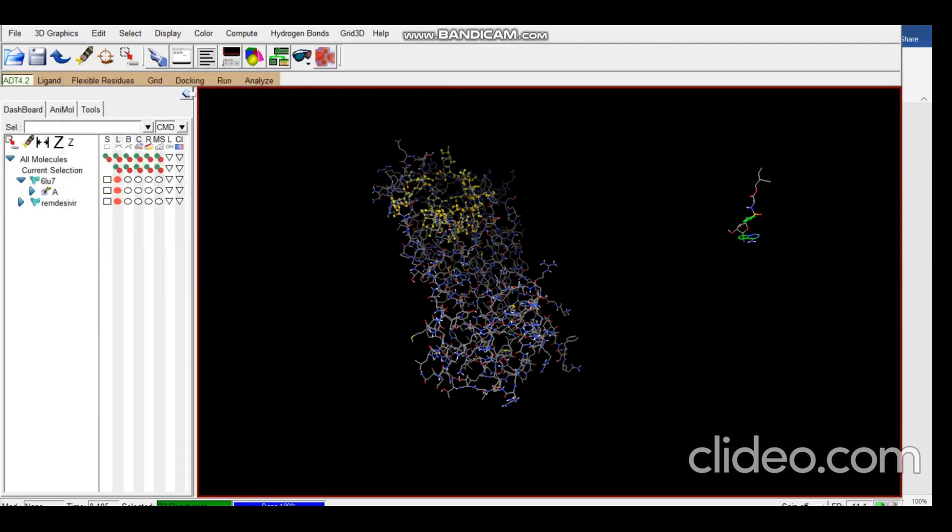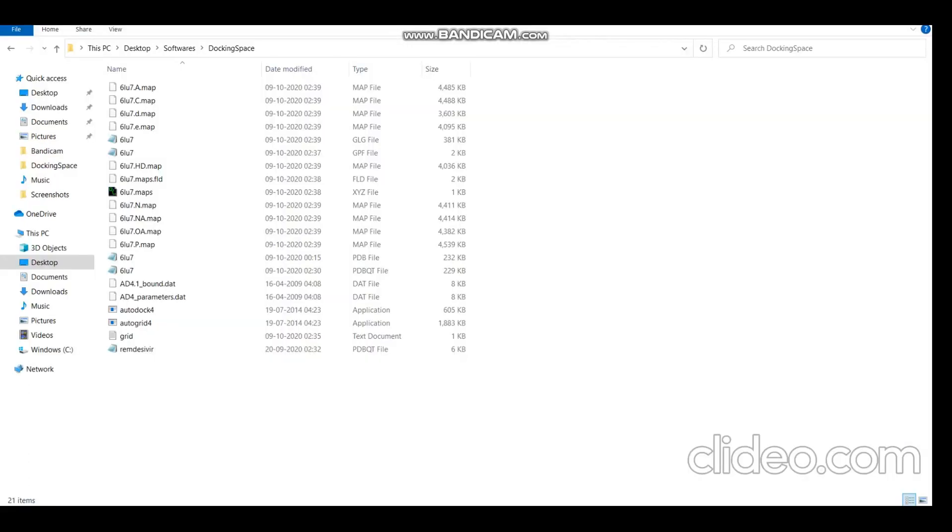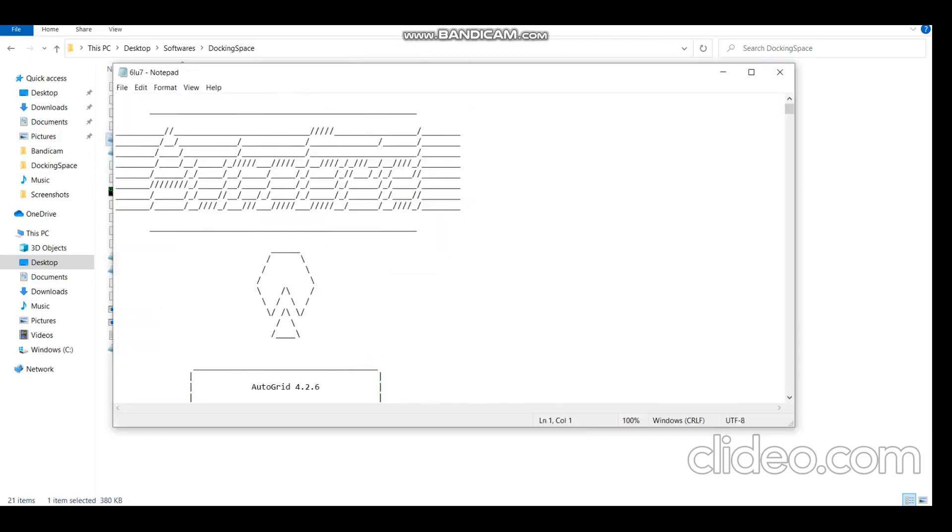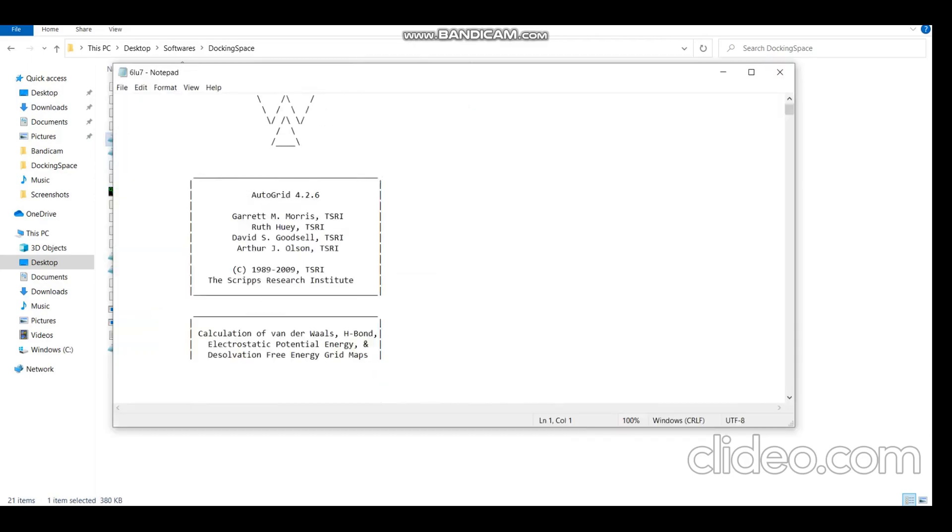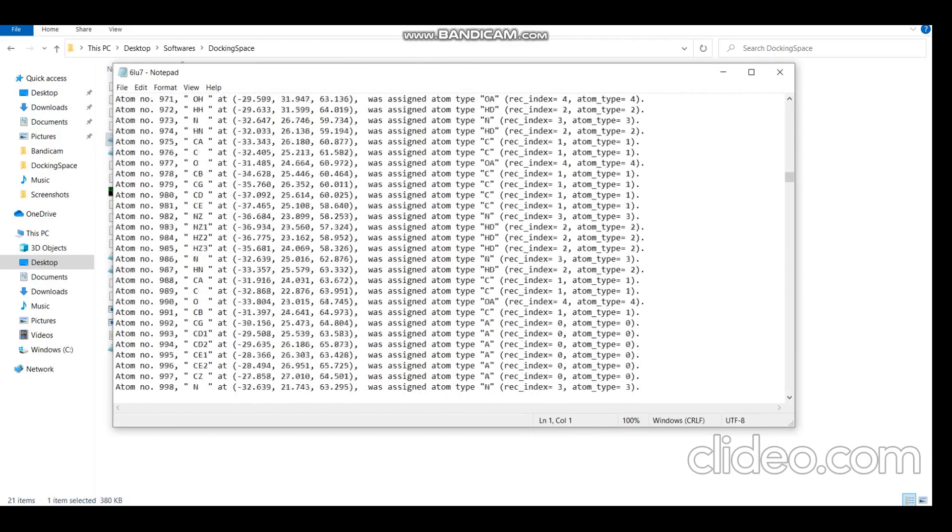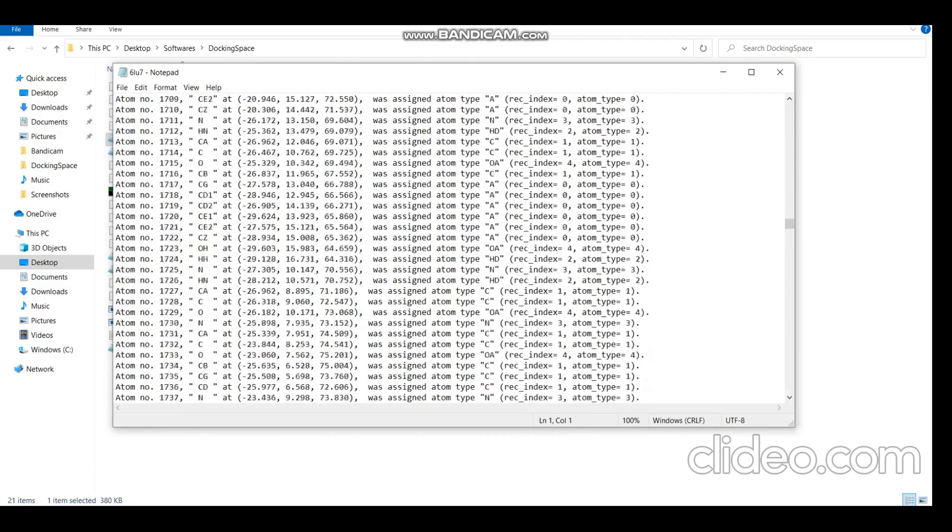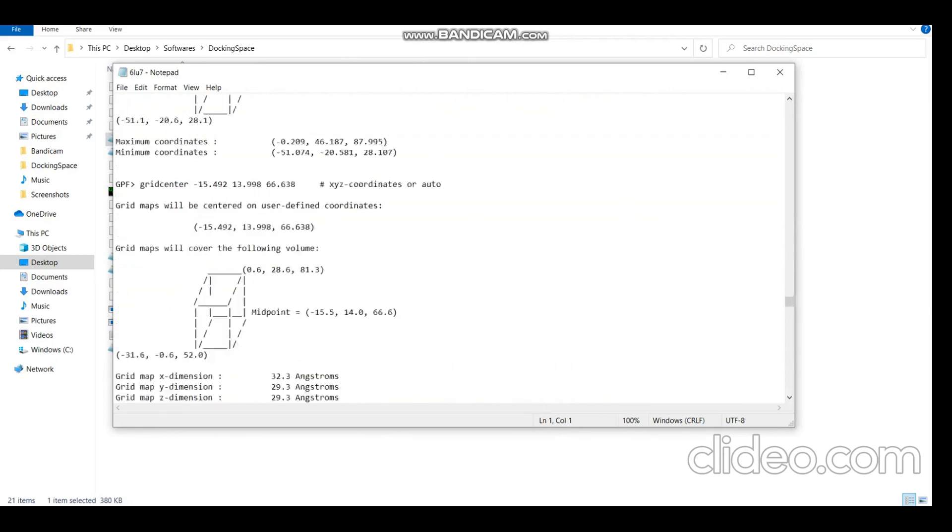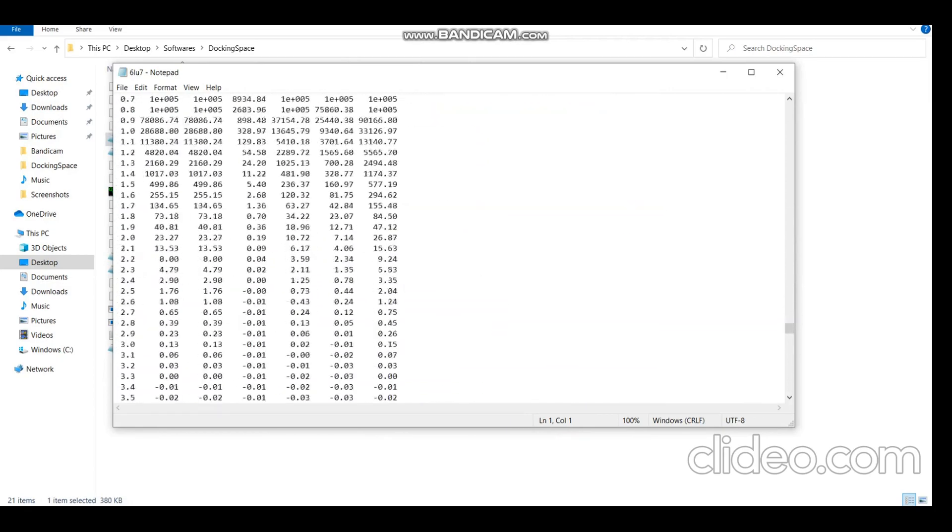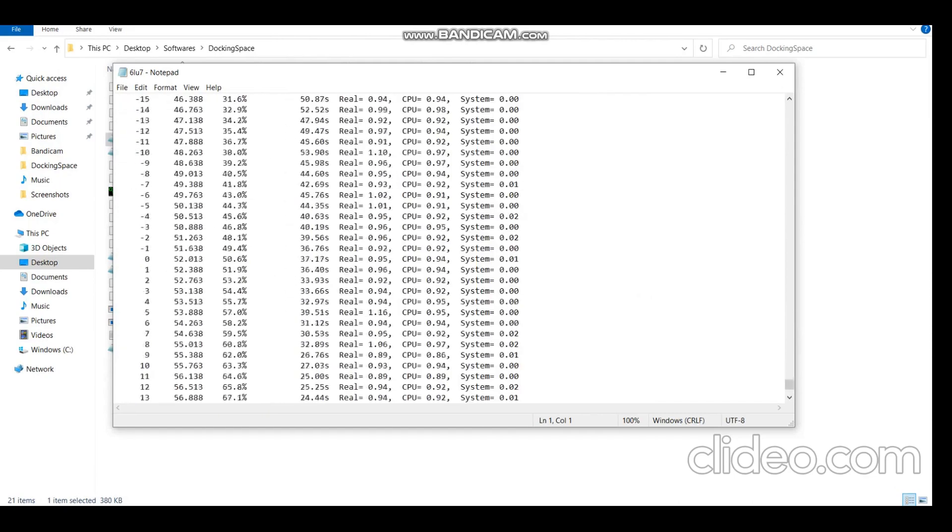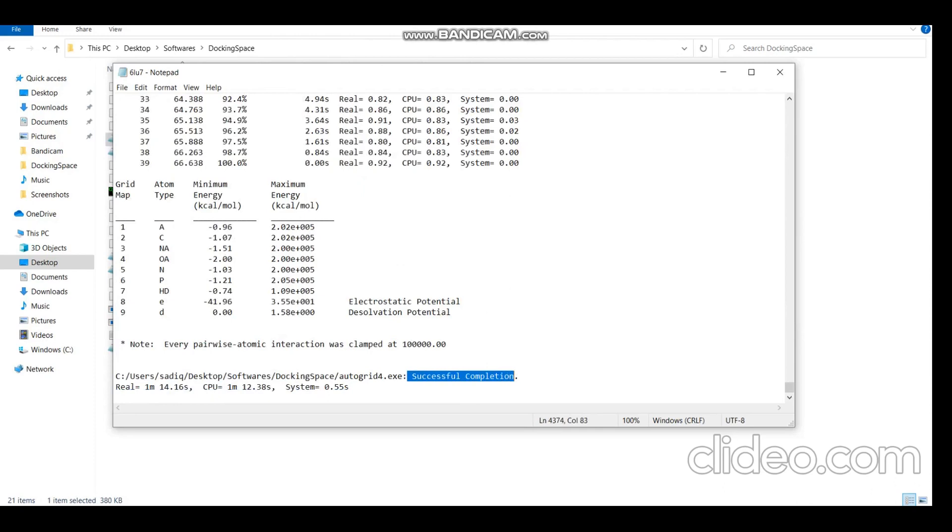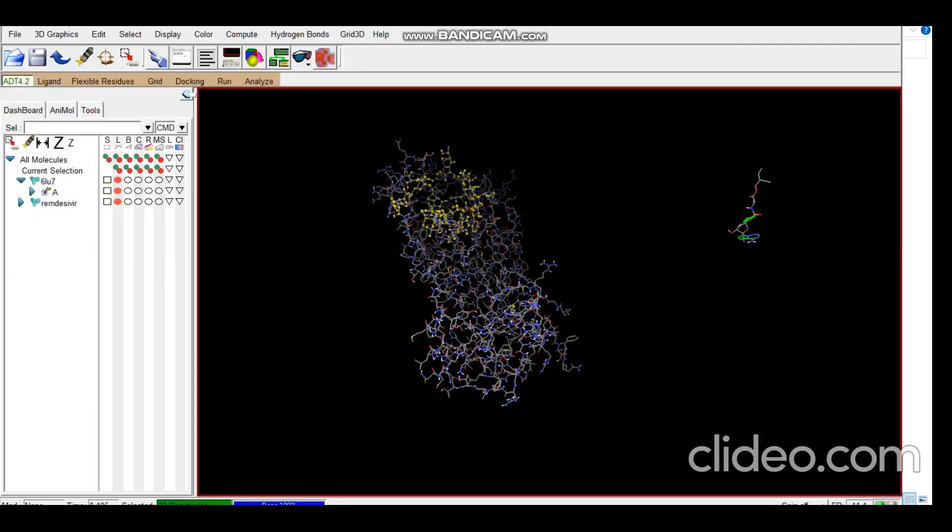So it's done. Let's just check our GLG file. Here you can see in your folder several map files are generated. This is the grid document and this is the grid log file we generated after running AutoGrid. The only thing we need to check is if the process was successful, that is at the end of this file. Here we can see Successful Completion. It also gives the time taken, so fine, the AutoGrid was successful.